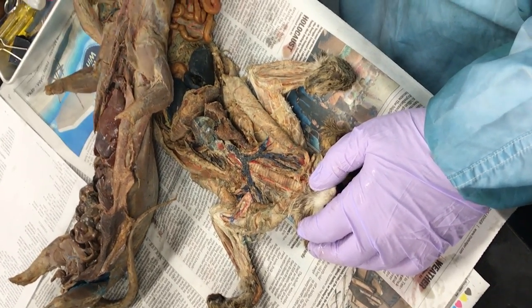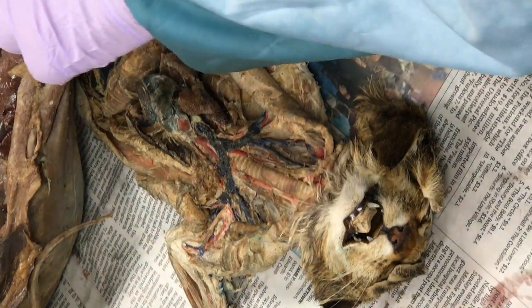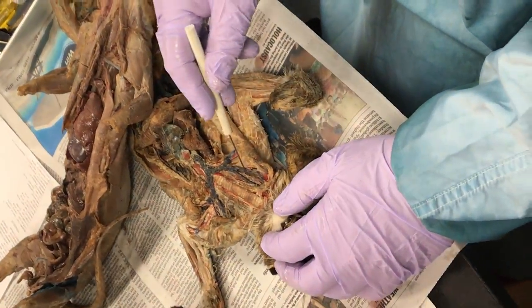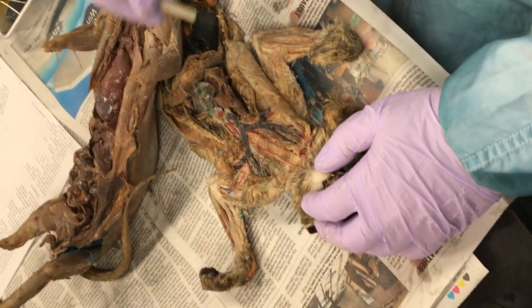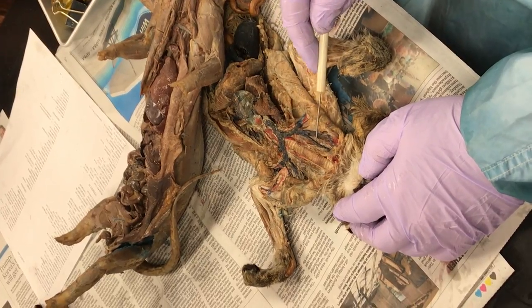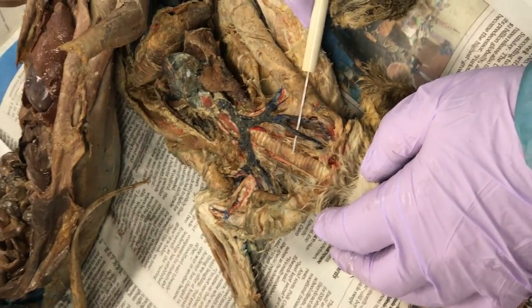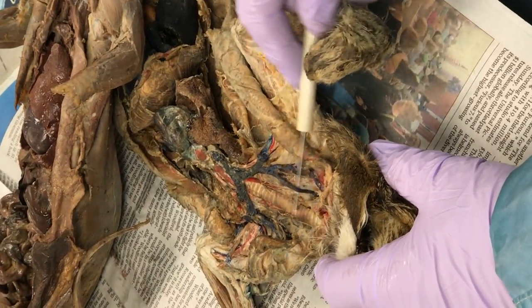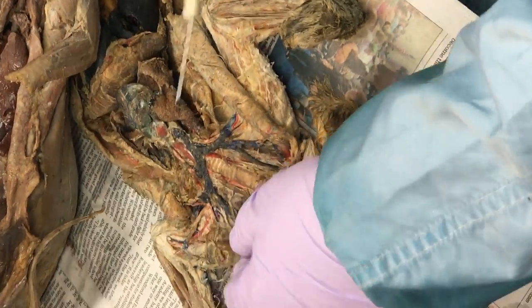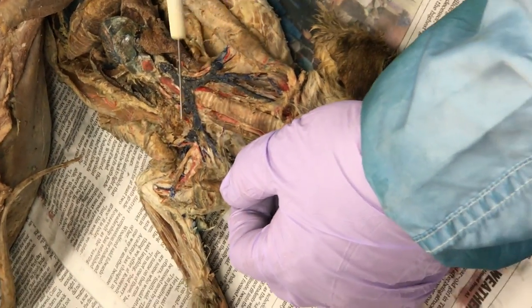Jugular. There are two of them — there's an external and an internal. Very well identified here. Yours kind of played out, but there it is — it's blue, it's lost its luster. But here's what you're going to see on the test — you're not going to see the appendageal veins on the test. So, external jugular, internal jugular. Branham, what's this vessel right here? The internal jugular. Okay. Now look over on this side — where's the internal jugular here? It didn't fill up, it's kind of mummified down there. But there's the external. So, external, internal.